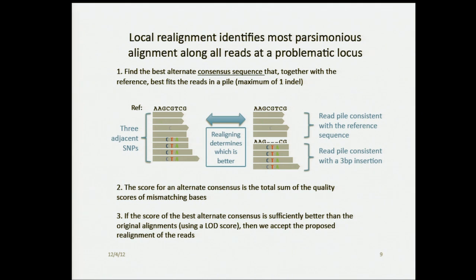But in cases that are simpler, and that can be handled with a unified genotyper, you look to divide the reads up into 2 different bins. One that is very clearly reference and doesn't show any problems, and ones that are fishy. You divide up the fishy ones using an alignment algorithm, a local alignment, really Smith-Waterman, to figure out whether there should be a gap or an insertion there.